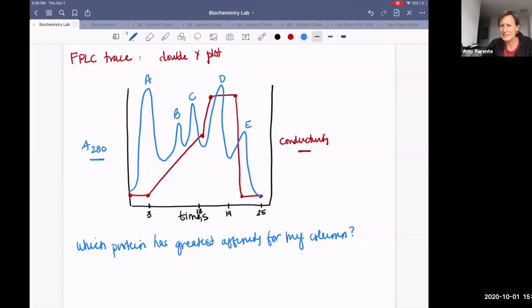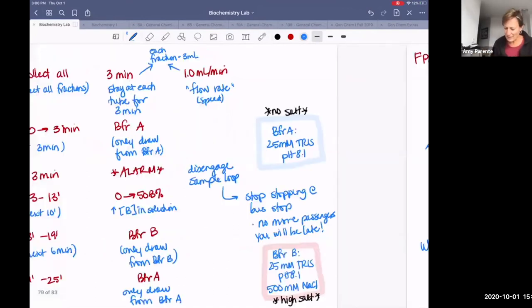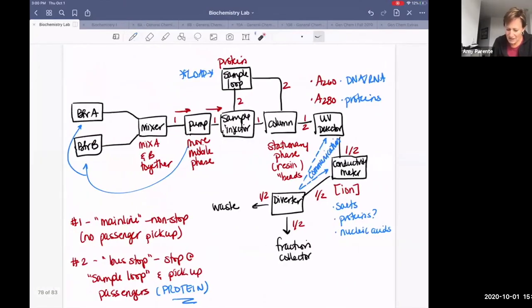the thing that comes out last. Doesn't matter what the column is. We'll get to those details later. But whatever comes out last, remember how this works. We've got stuff that's coming through our pipeline, and let's imagine that we've gone and picked up everything.